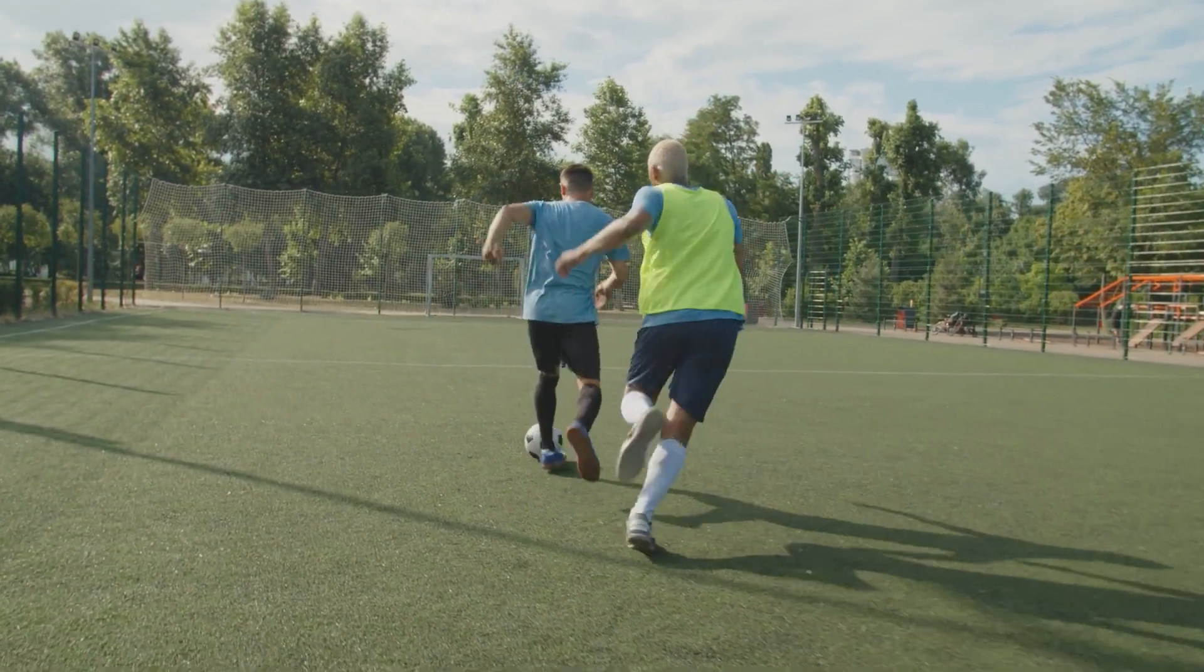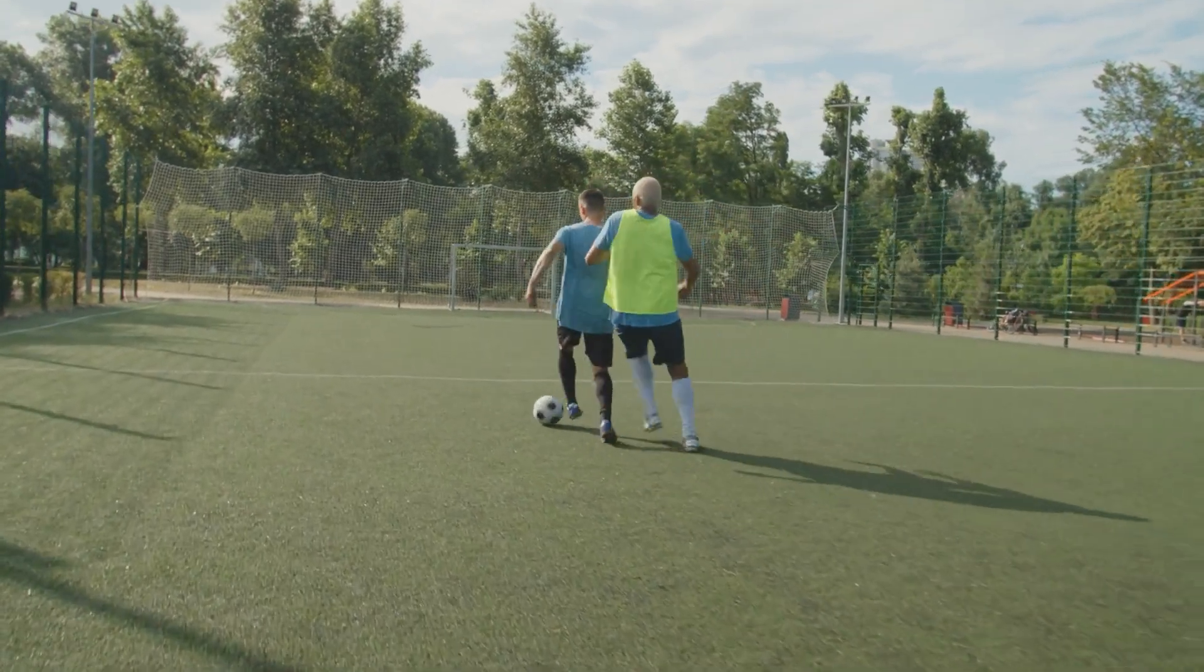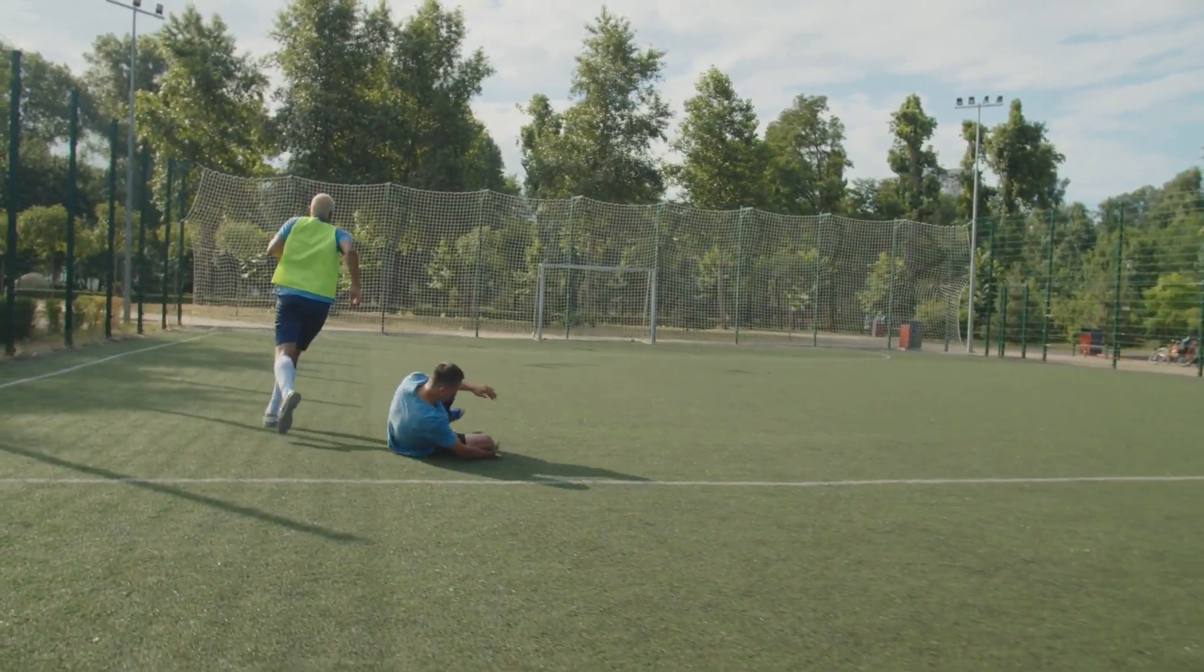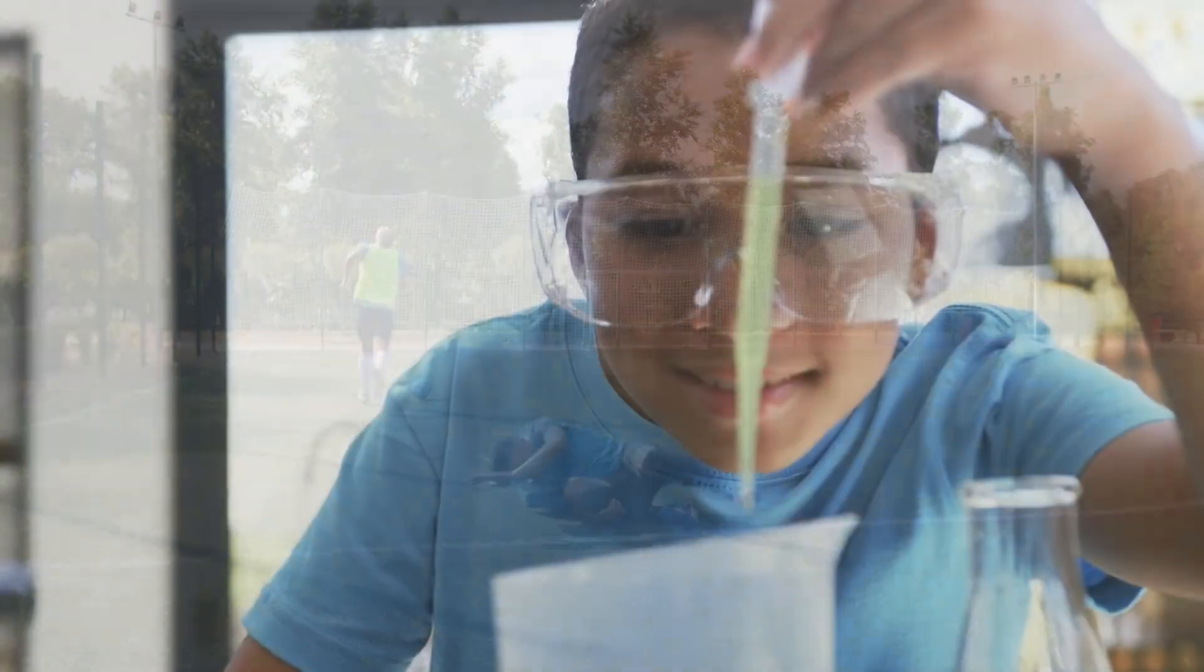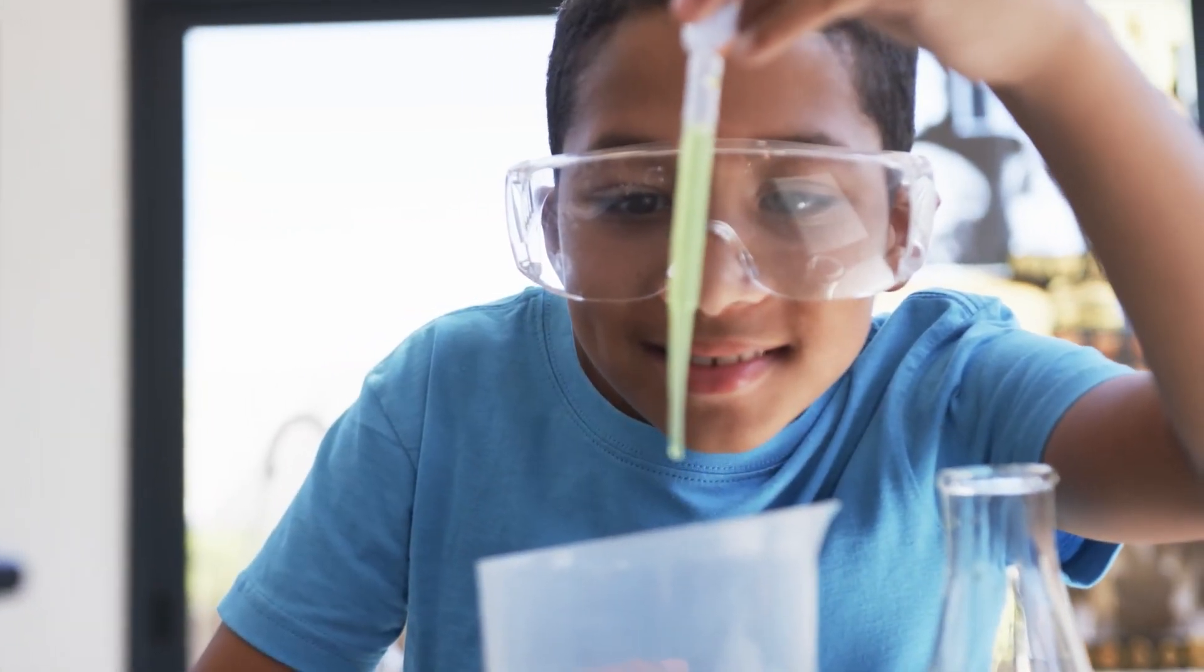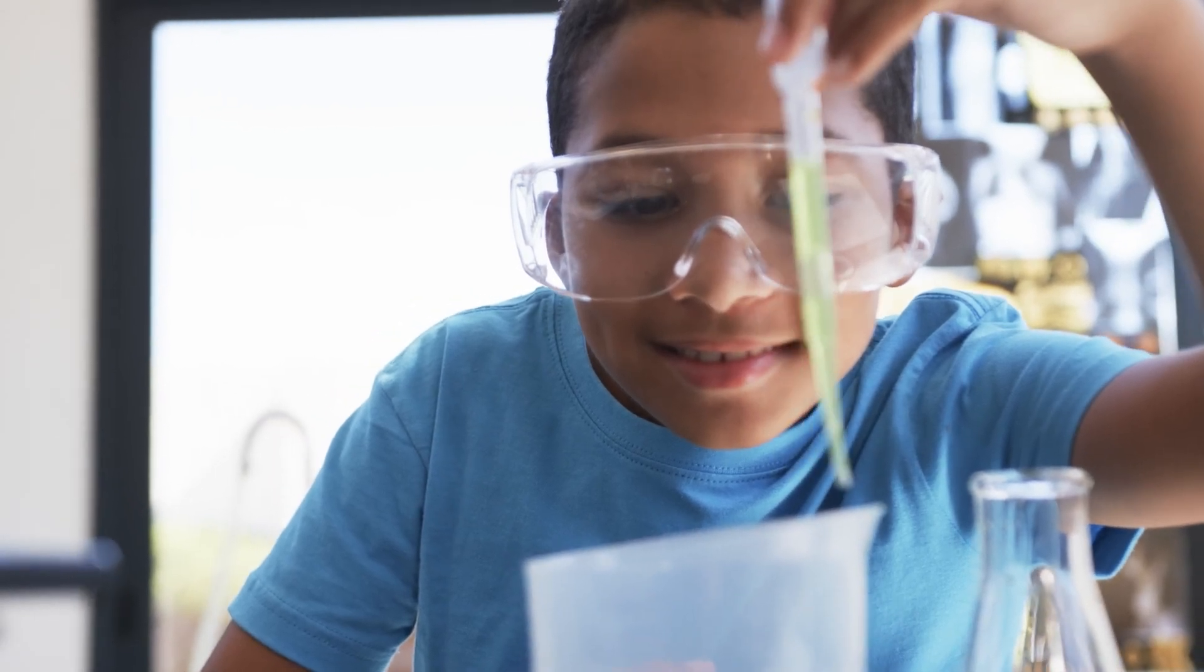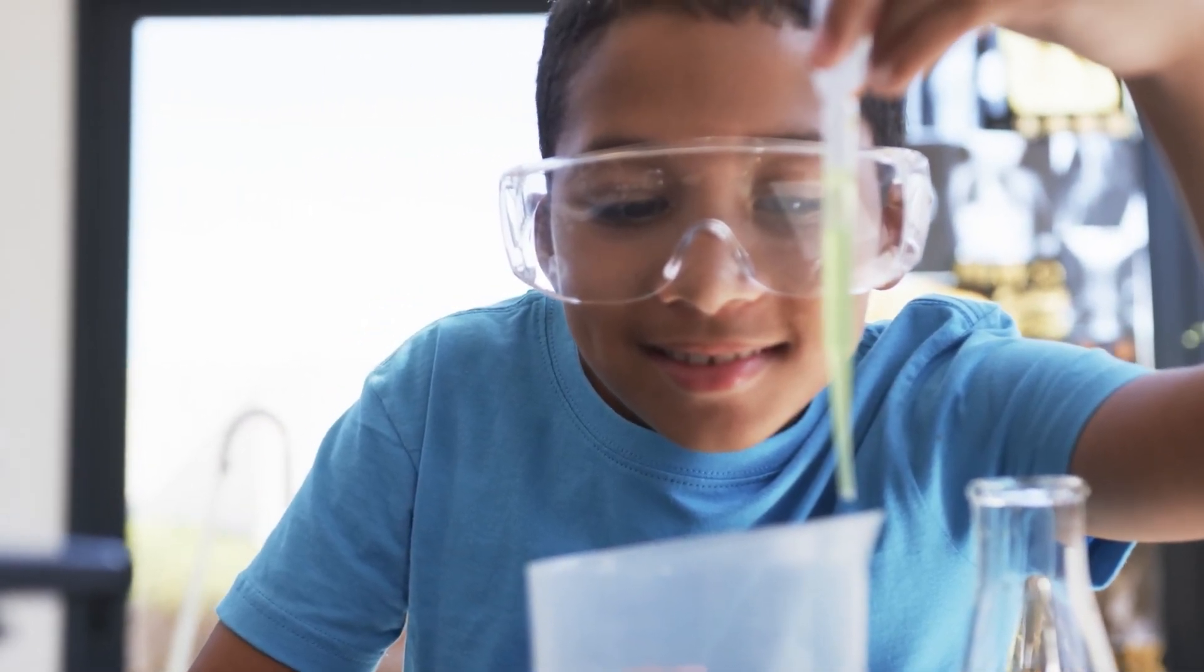Lab safety is like learning the rules of a sport before you play the game. Imagine stepping onto a basketball court or soccer field without knowing the rules. People could get hurt and the game would be total chaos. In a lab investigation or science experiment, lab safety rules are your playbook to make sure everyone stays safe and the game goes smoothly. So, what's in this science safety playbook?